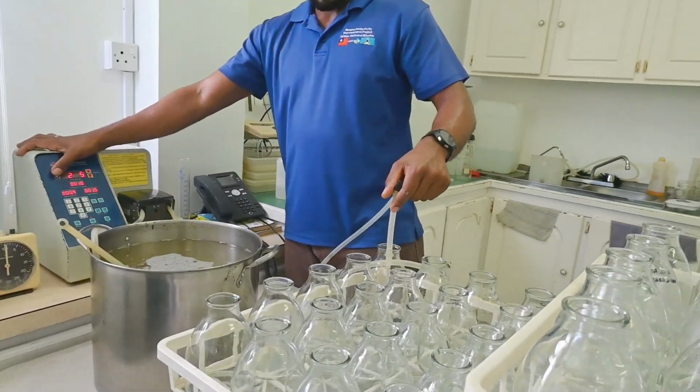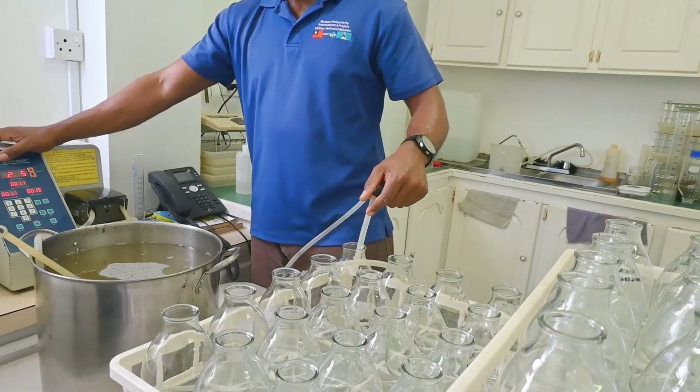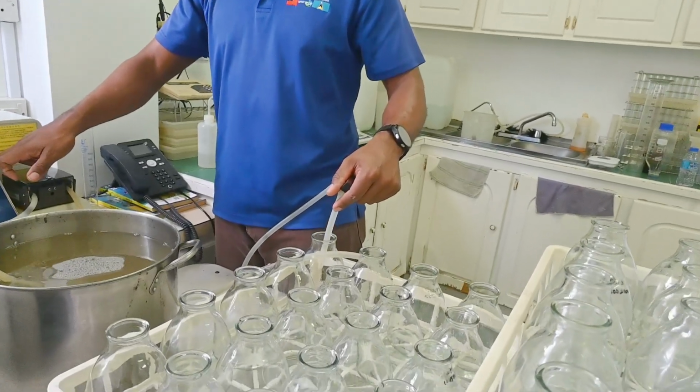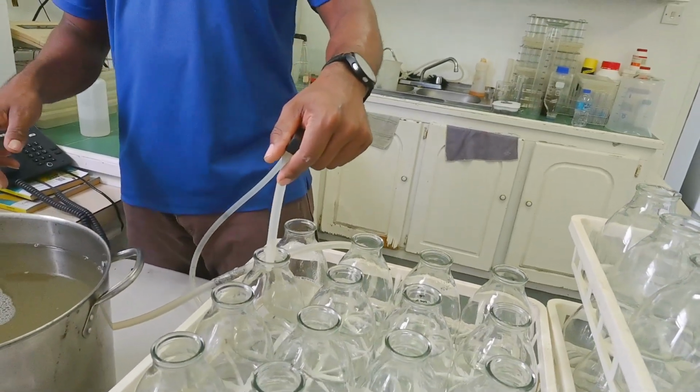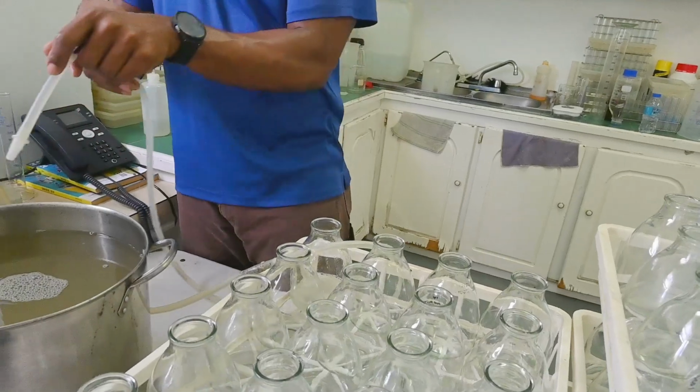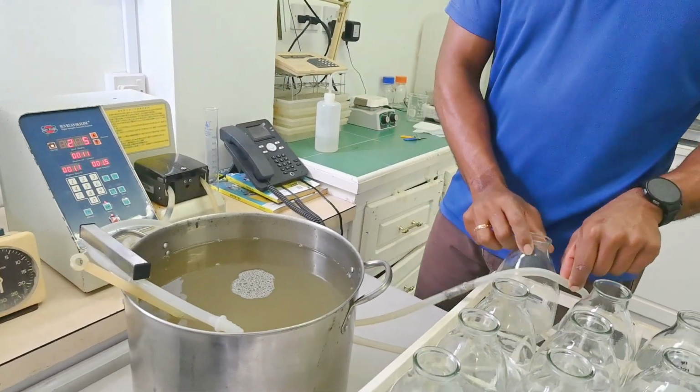I'm going to dispense in one bottle. You see it automatically starts and stops. It has a 1.5 second delay time between when it stops and when I can transfer to another bottle and it starts again. So you're going to take the measurement to see if the calibration is correct.